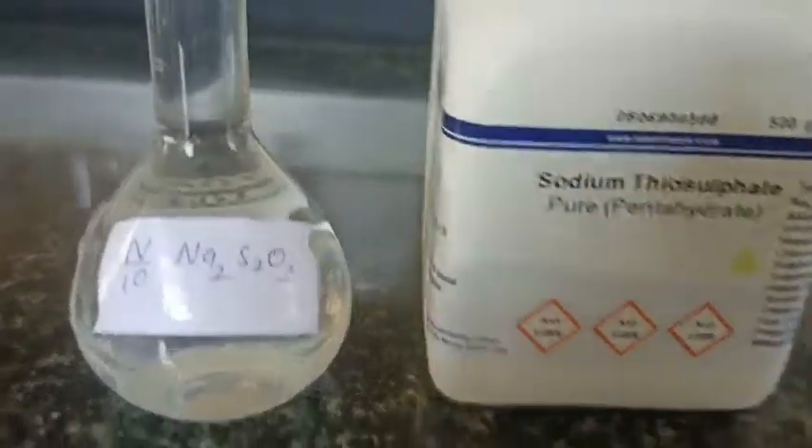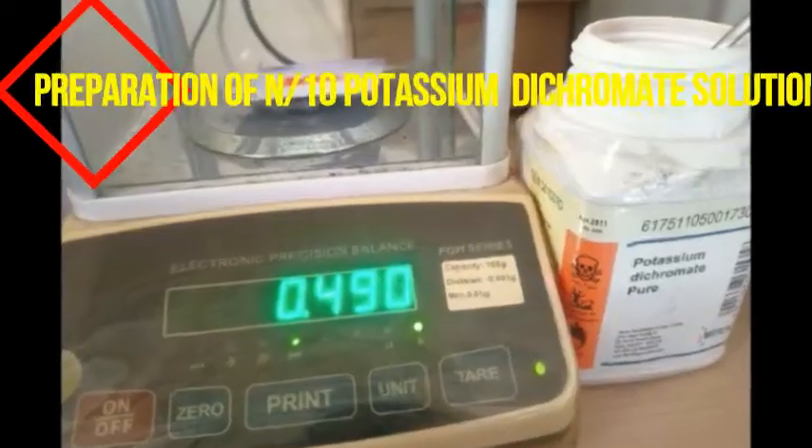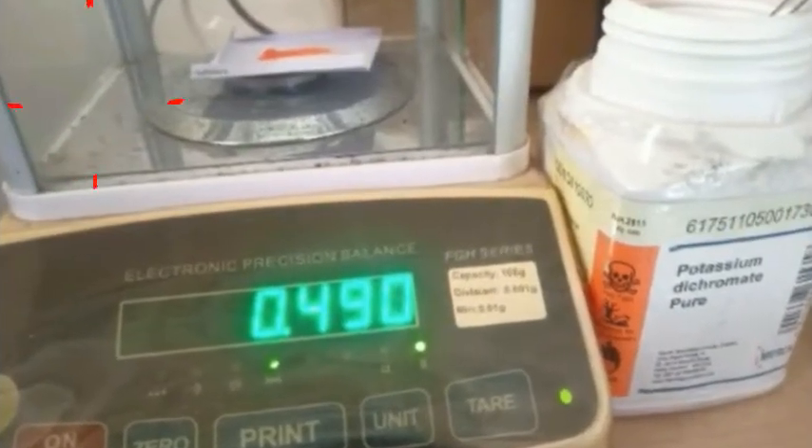This is how we prepare sodium thiosulphate solution — weighed and calculated as N/10 sodium thiosulphate, and this sodium thiosulphate is pentahydrate.